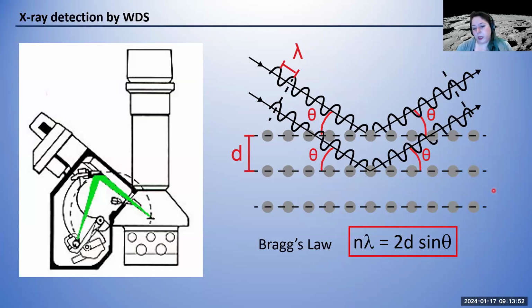But it also means that we usually have to know ahead of time, or at one point in the process, what exactly we want to analyze, because instead of just saying show me whatever is there, we have to say, I want this element and this element and this element.